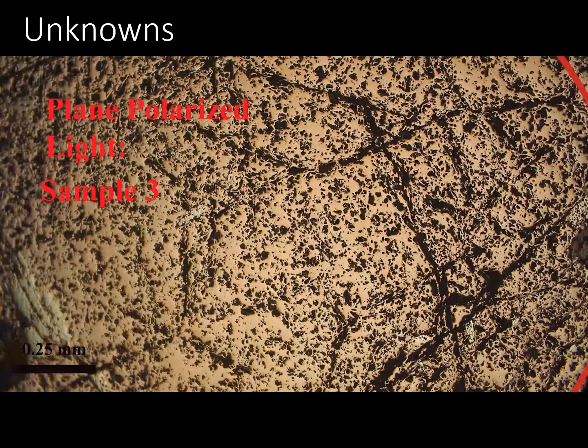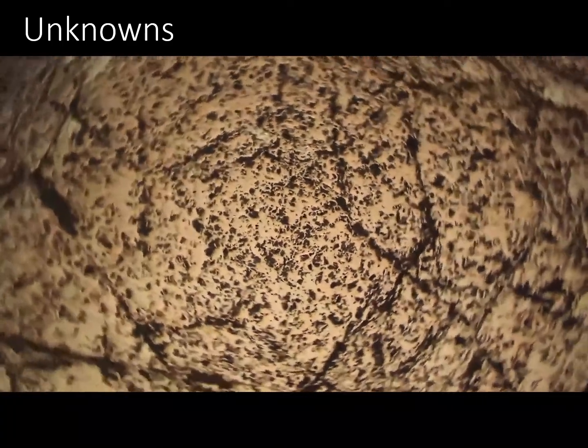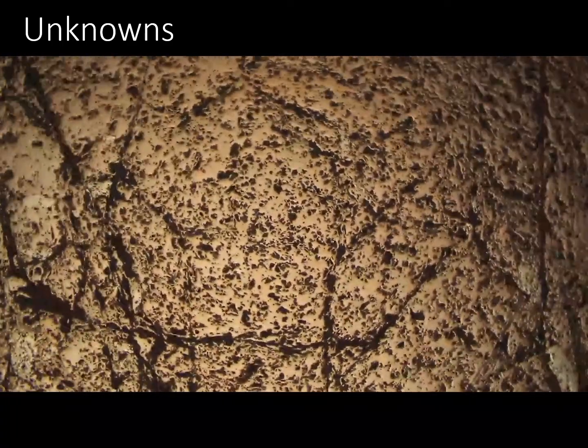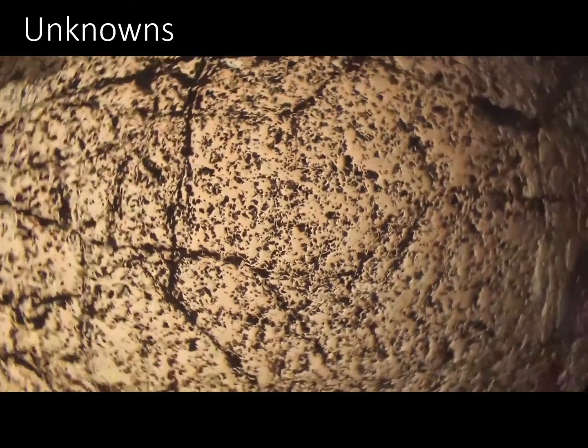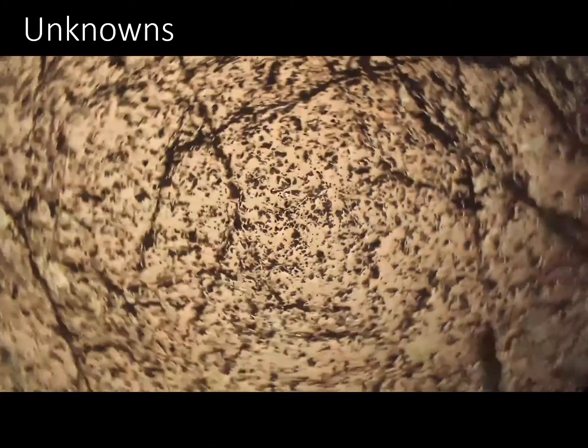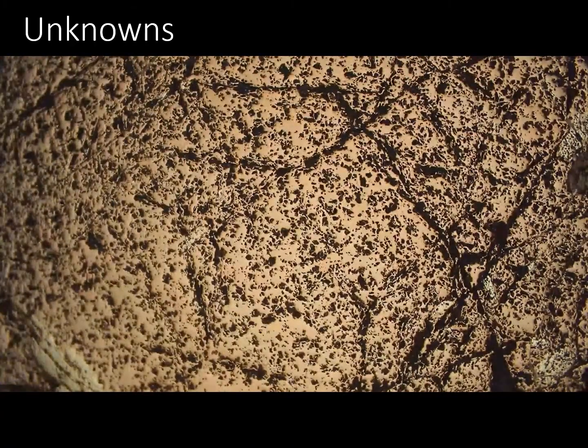And now we're in plain polarized light on sample 3. Now we're in cross-polarized light on sample 3.